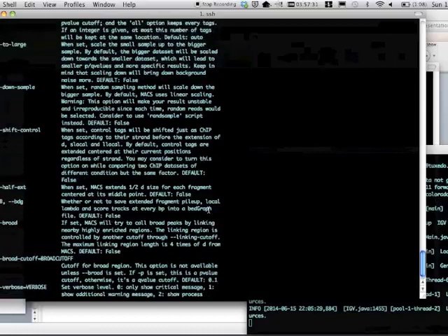Okay, so now we will take a quick look at what a job that we submit to Slurm, which is the job queue for the cluster, will look like when using MACS2 to call peaks in a particular dataset.